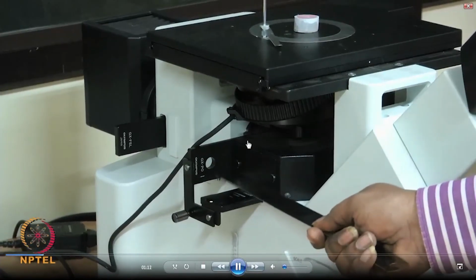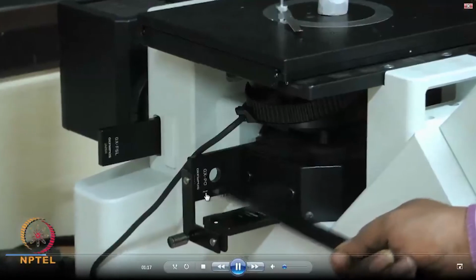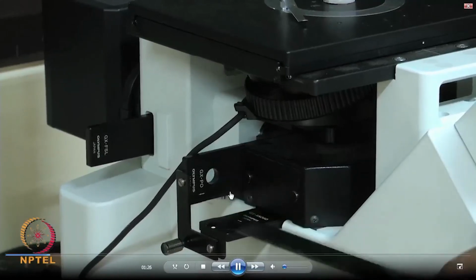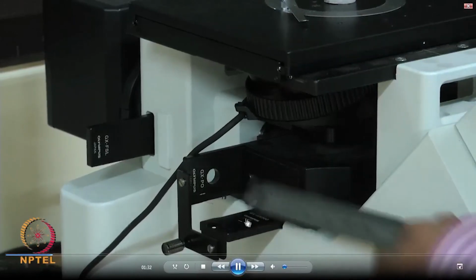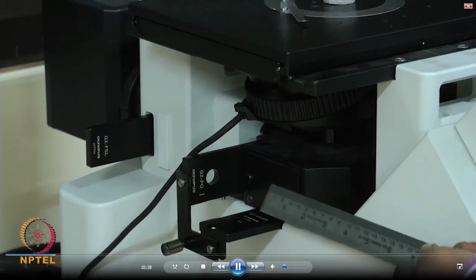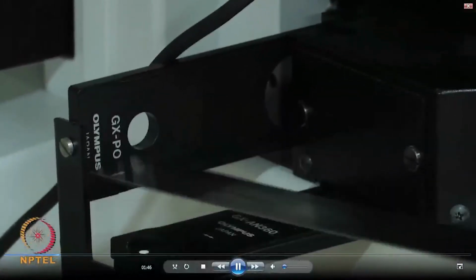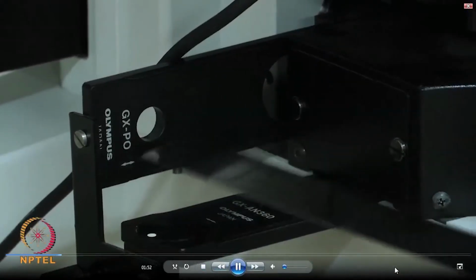What you are now seeing is a polarizer kept in this orientation, and you can see there is a mark here which indicates the plane of vibration of the waves in that direction, and you have the analyzer, and you can also see the mark here which is in the perpendicular direction of the polarizer. You can now clearly see in a much closer view the polarizer, and then this is an analyzer.